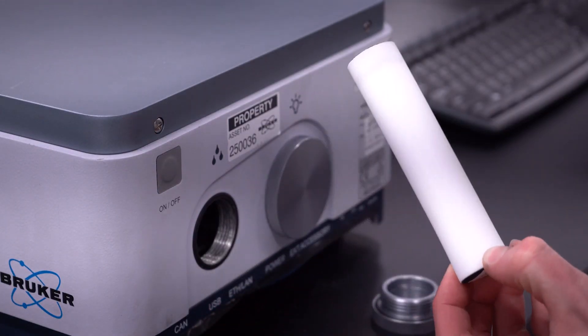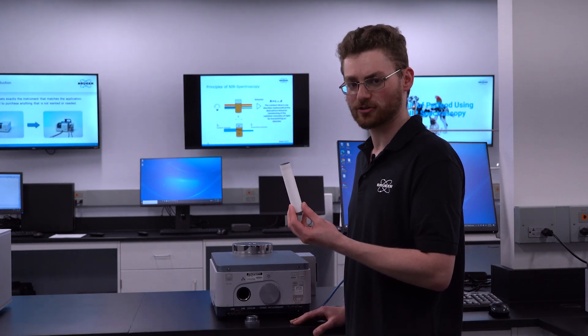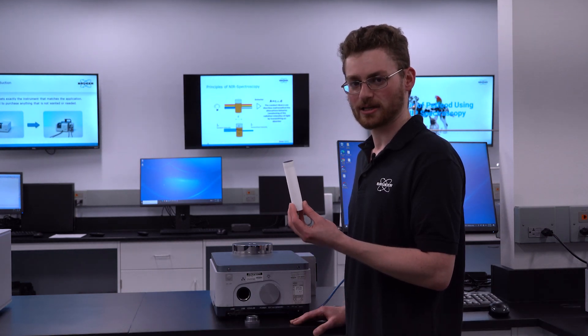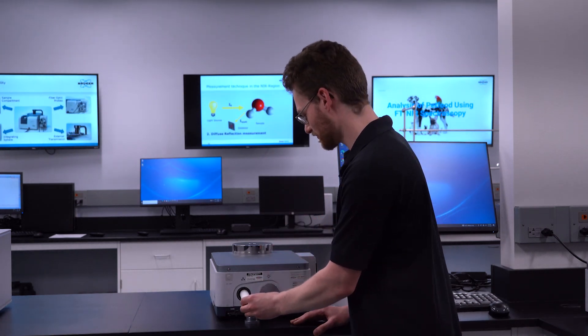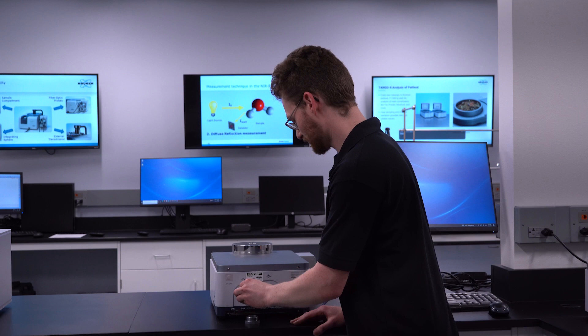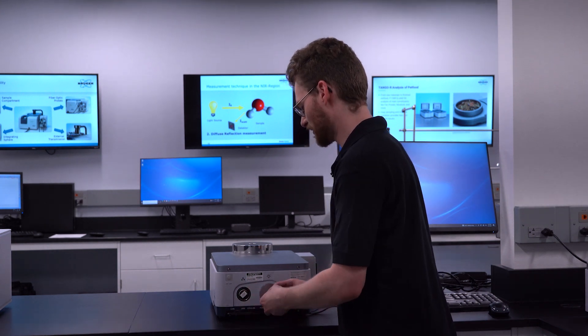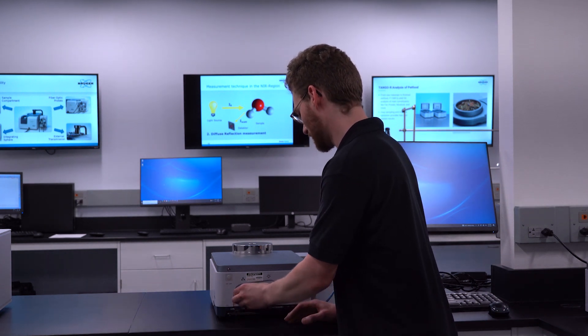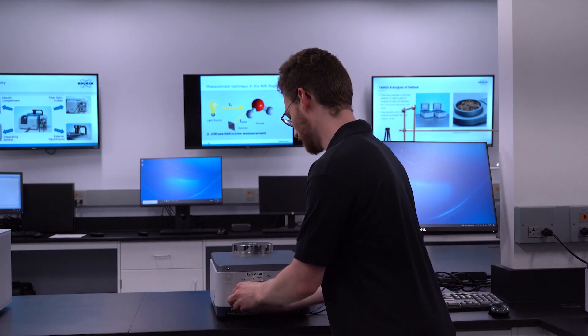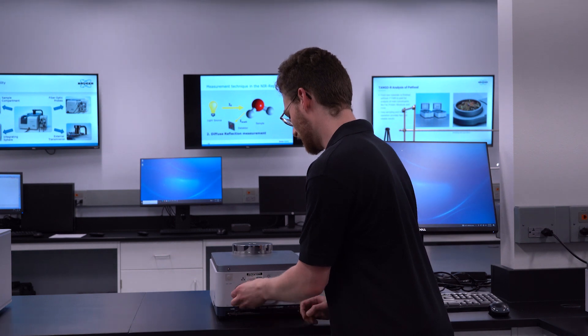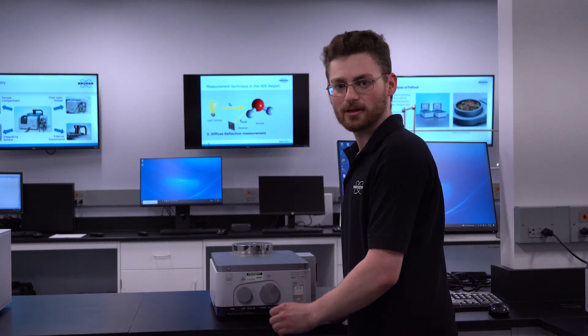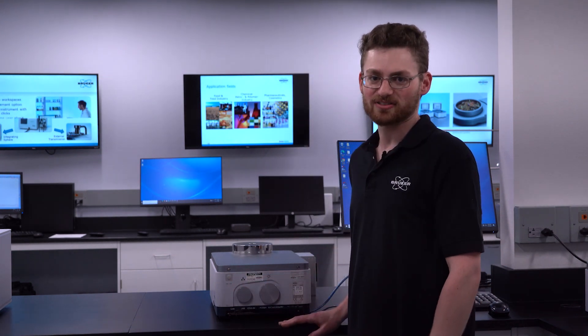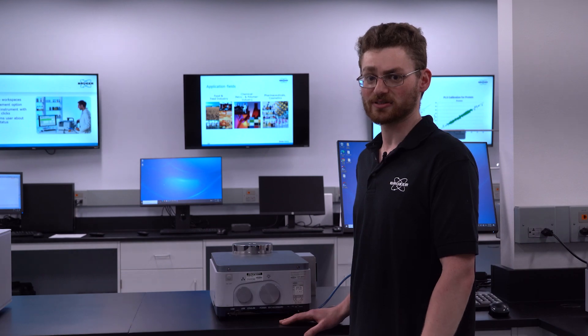We recommend that you have two desiccants so that when you take out one to regenerate it, you have another that you can simply put in so you do not lose any time and screw back on the cap. The lifetime of the desiccant depends on the environment that the instrument is in.